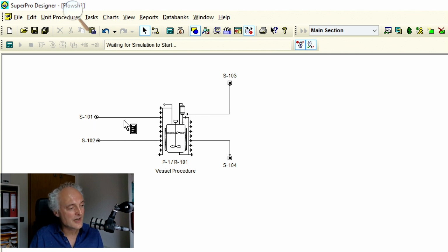Now, obviously, these are the input streams. So see, this is what goes into the reactor. This is what's going out. And you see that each port is one stream. So as we charge two solutions, we charge a 20% acetic acid, and we charge a 15% sodium carbonate. This goes into these pipes, more or less. We pipe that into this vessel, and at the end, of course, we put something out. This we talk about later.